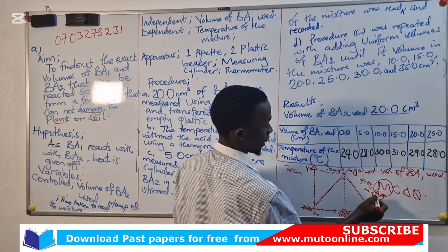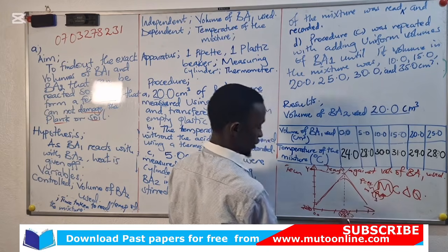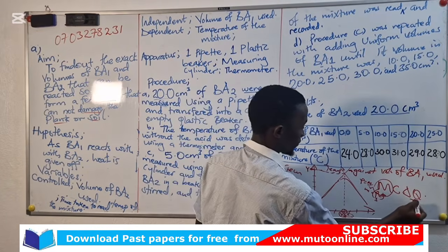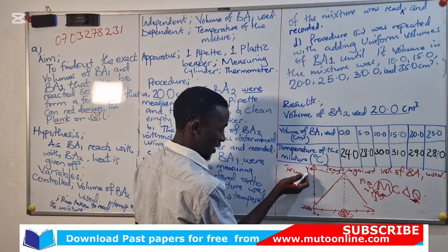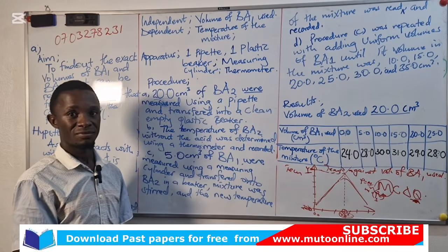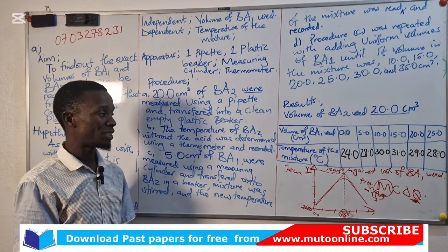The density is usually 1 for solutions, and the volume is the one you determine here. The standard temperature we use, or the maximum temperature, is this one, in the theta. I think we are following.